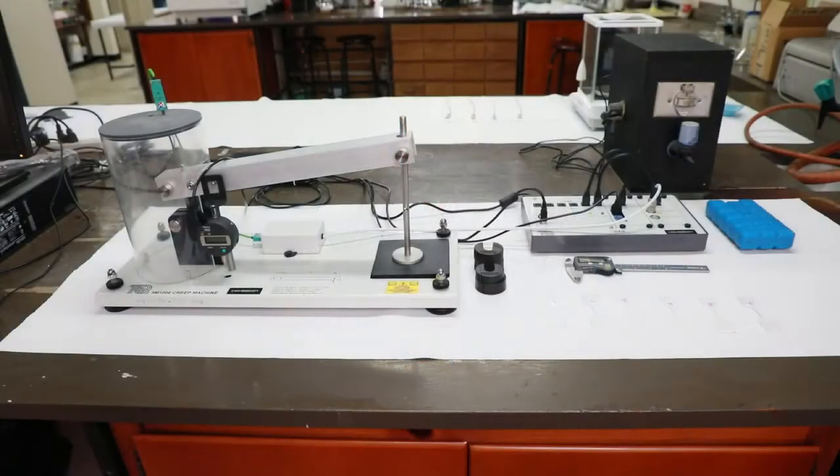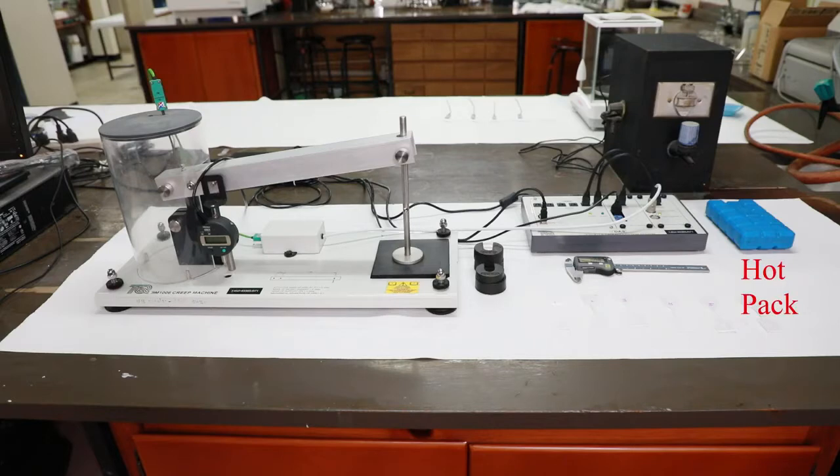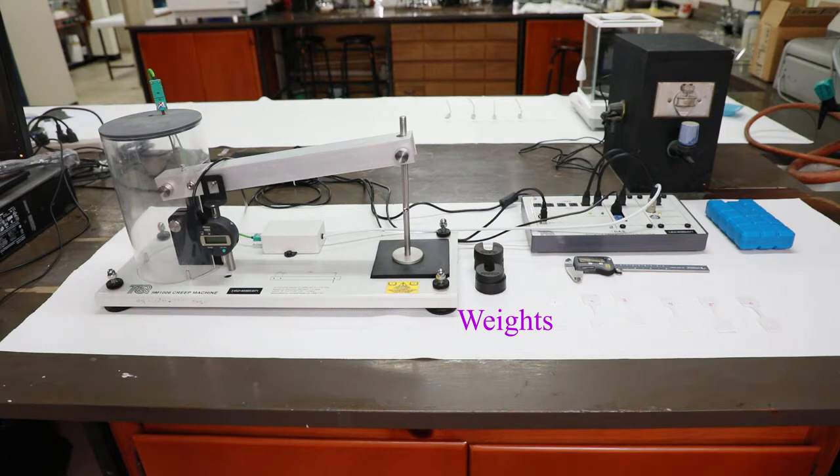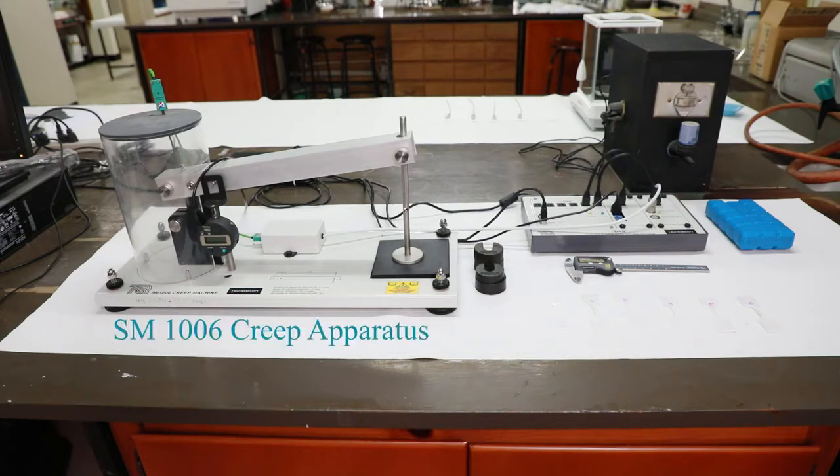We will be using six polypropylene strips, a vernier caliper, hot pack and cold pack, thermometer, 0.5 kg and 0.6 kg weights, water bath, computer and SM1006 creep measurement apparatus.